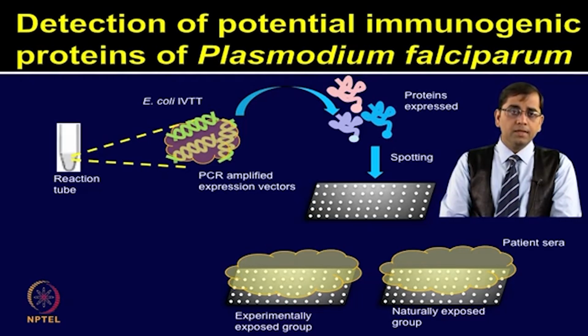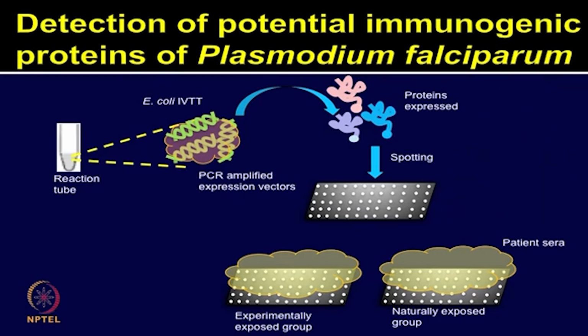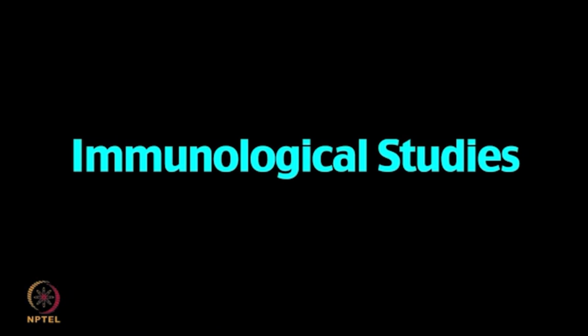They identified proteins expressed specifically in the pre-erythrocytic stage of Plasmodium, which was CSP, as well as some liver stage specific antigens such as LSA1. They also identified several proteins successfully by applying cell-free expression based protein microarrays. Let us now discuss this experiment by looking at this animation.